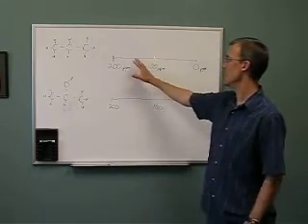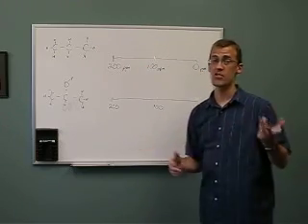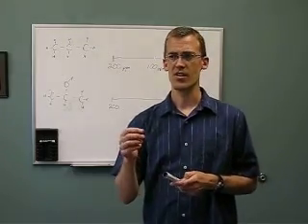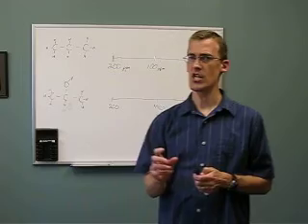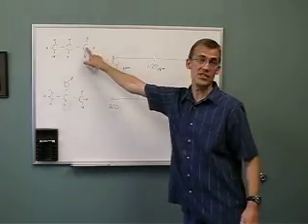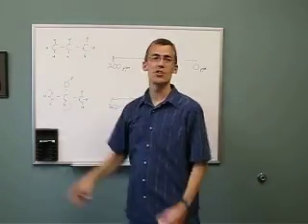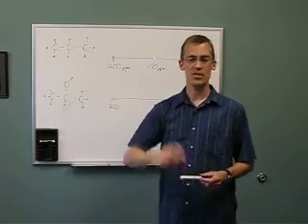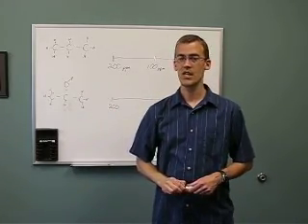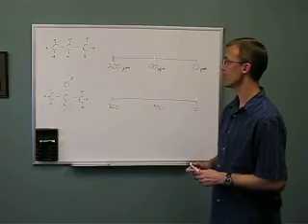But basically we have energy on this axis, and the question really is how much energy, so now we're talking about the RF frequency, how energetic of RF radiation, what is that frequency that causes this nucleus to flip its orientation? So there are 3 carbon nuclei, and they're all going to flip their orientation with a specific RF frequency. And the question, of course, is which frequencies will cause that to happen?